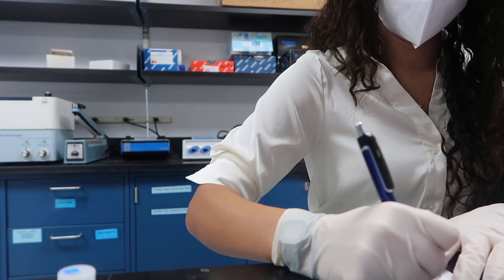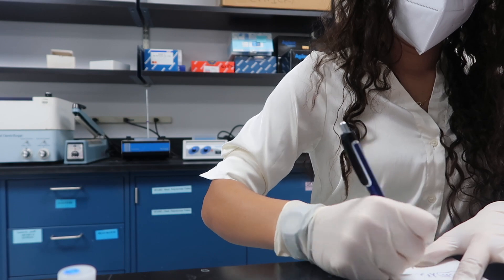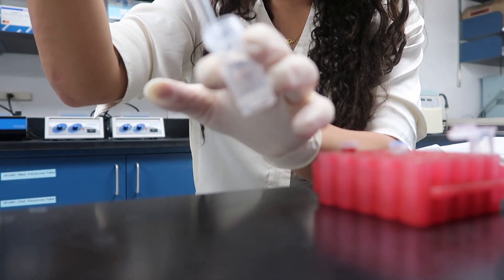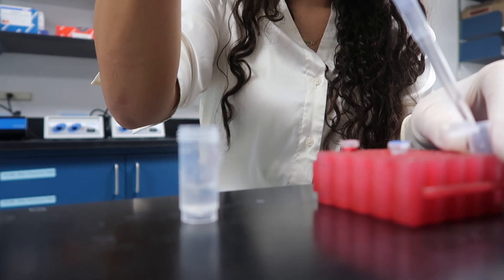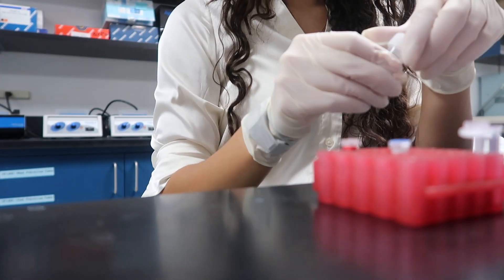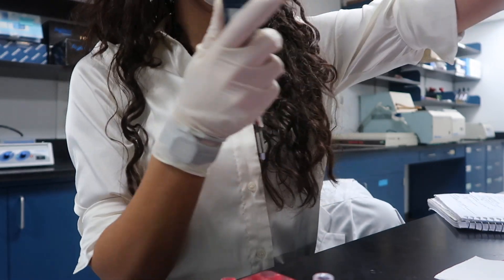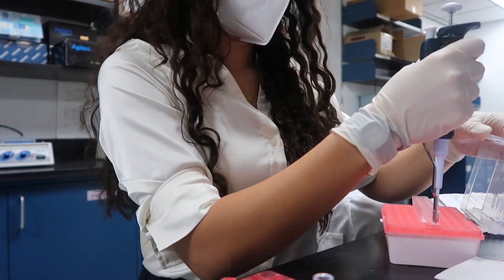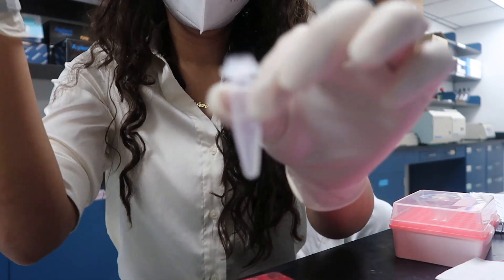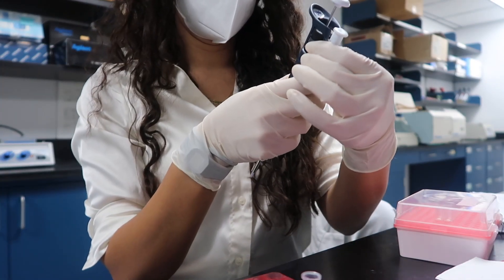1,500 microliters, and I need a 1 to 1,000 and a 1 to 500 — Donkey anti-Rat and Donkey anti-Rabbit. 1.5 Donkey anti-Rabbit, 1.5, and 3 Donkey anti-Rat. So I'll just do 1.5 twice. Quick maths.